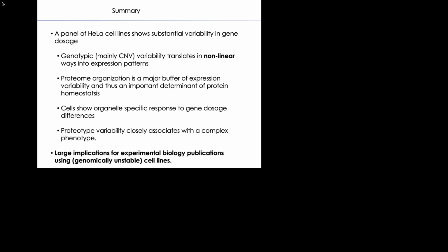And I tried to show an example where we use this inherent genomic variability as an opportunity to learn new biology by using the breadth of data that is collectible now by mass spectrometry, of course also by other high throughput techniques. Then I tried to pose 3 questions and say, where in the field of proteomics, when we have same data, can we get same results? If you have same samples, can we get same results? And if we do the same experiment, do we get same results?